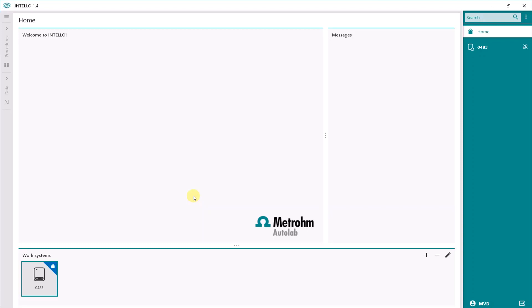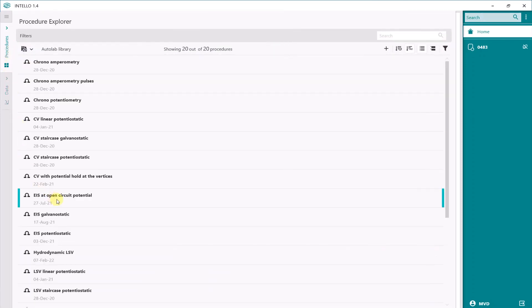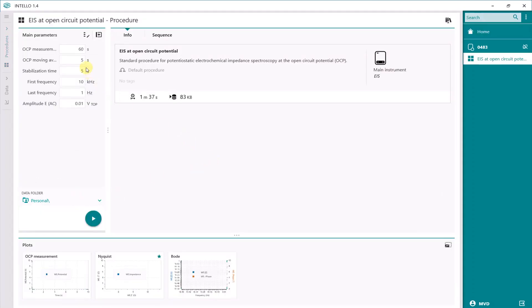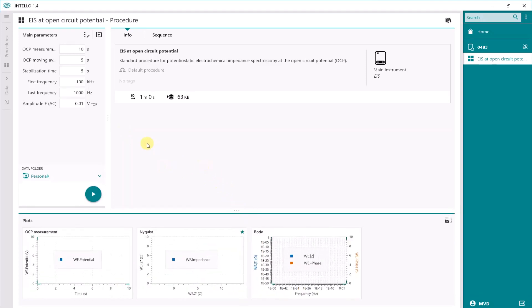Welcome to the INTELLO software. First, we are going to determine the uncompensated resistance. We do this with EIS — electrochemical impedance spectroscopy. We go to Procedures, and in Procedures you will find EIS at open circuit potential. Select this one. It measures the OCP for 60 seconds, but we are going to minimize it to 10 seconds for time's sake. First frequency: 100 kHz down to 1000 Hz. The rest we keep the same. So it is a very simple modification of a few main parameters, and then we can start the measurement.